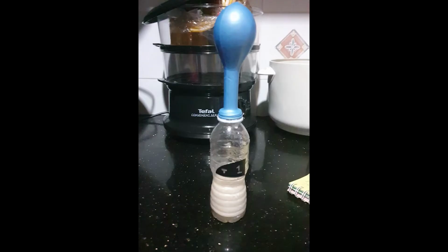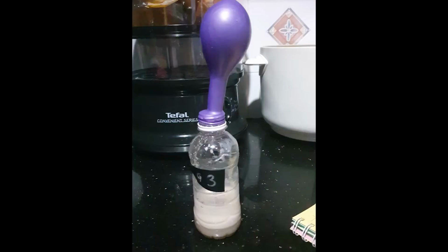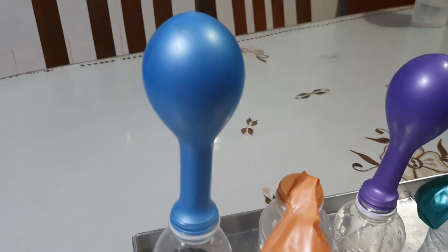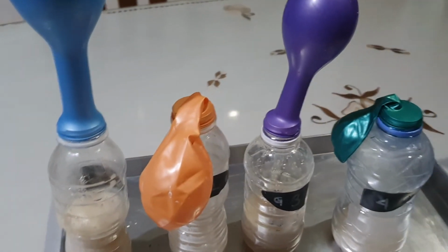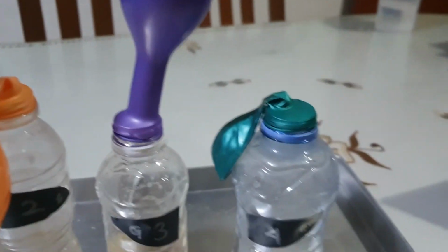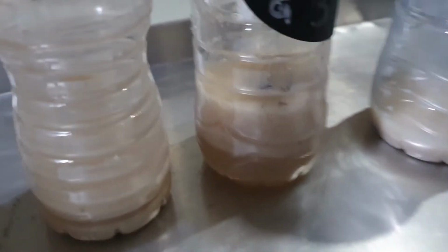During this process, the yeast will undergo anaerobic fermentation by breaking down the sugar molecules into carbon dioxide and alcohol. The production of carbon dioxide gas will slowly inflate the balloon in the experiment. Therefore, yeast activity can be measured mainly by observing the size of the balloon and the bubbles that can be seen inside the bottles.